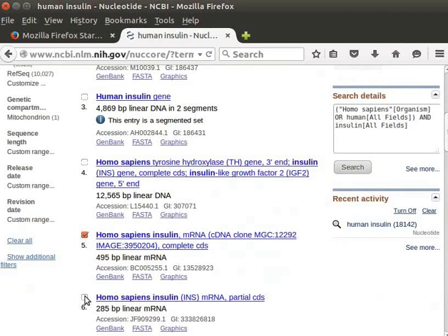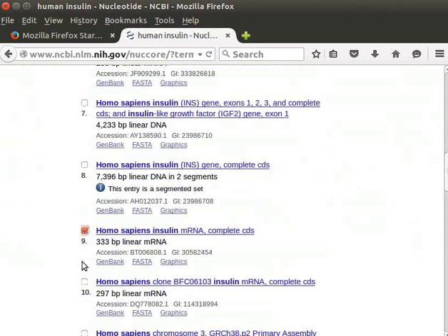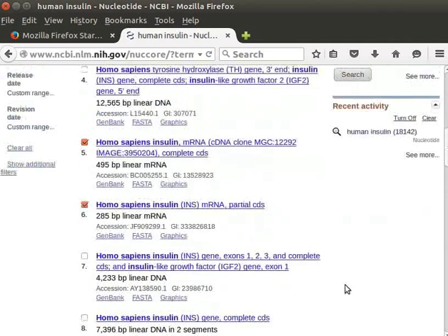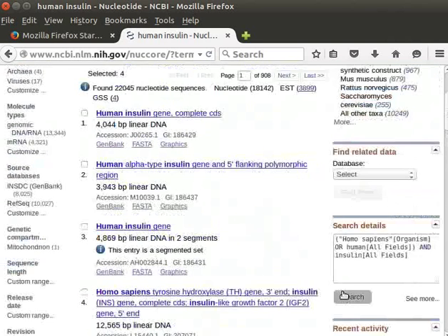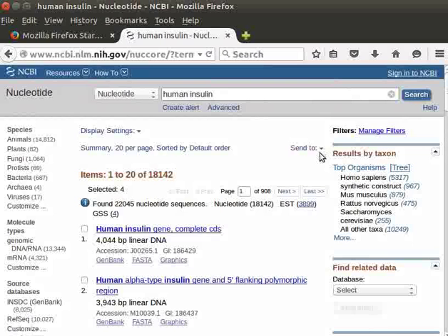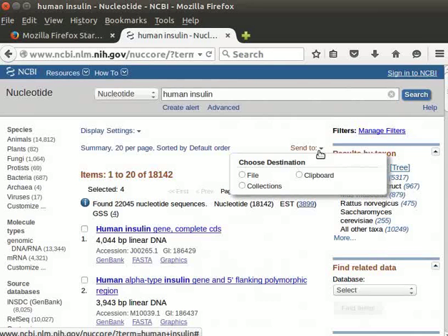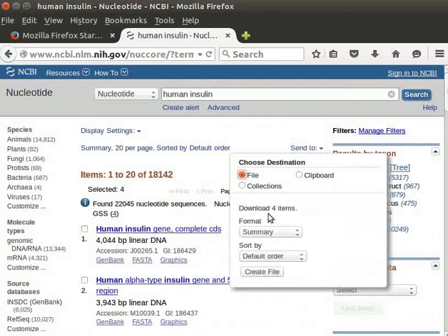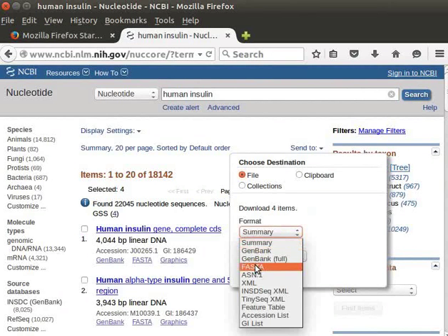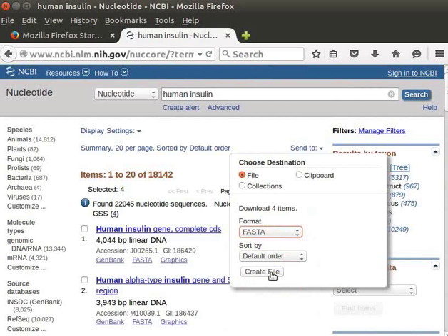Click on the checkbox to select the file to download. Bring the cursor to the 'Send To' option located at the top right corner of the page. Click on the small selection button with a down arrow next to the 'Send To' button. Under 'Choose Destination', click on the 'File' option. You can save this file in any format listed under the Format drop-down list. Choose FASTA from the given options, then click on 'Create File'.